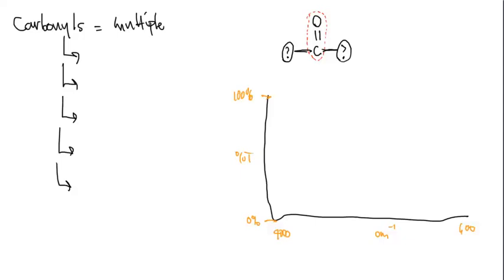And in the infrared spectrum, what I will see if the compound has a carbonyl is a big dip that looks like this. That is the presence of a carbonyl functional group. Now, remember we had words that explained the shape of the peak or the shift.